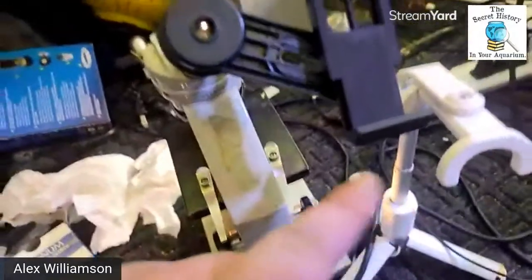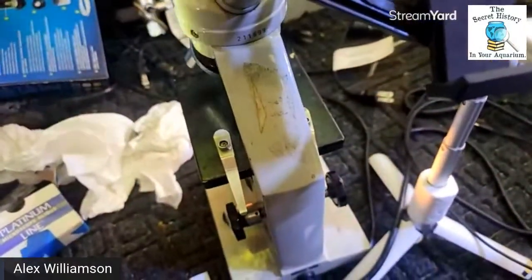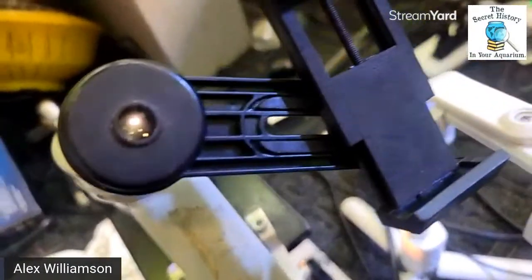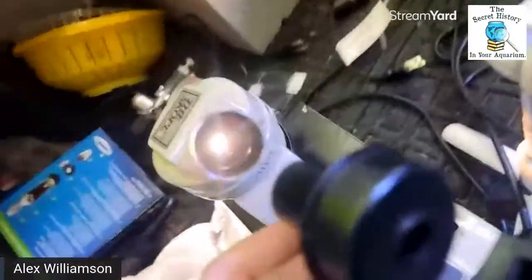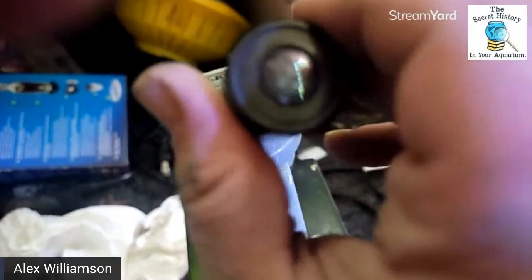But this is my little setup, just another little tripod. Then we add extra light with, it's called a Duracell high powered 550 lumen LED torch. So it must be made for Europe or something. And then here the camera can be mounted, and this thing was only like 15 or 20 bucks. I should add it to the links I have below. And then this just pops out, and then you can put back in this like so. But this eyepiece was always trashed from the beginning. And yes, it does add to the magnification tenfold. But you can also get that with the phone that I happen to have.